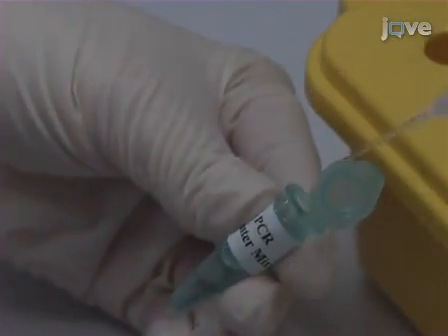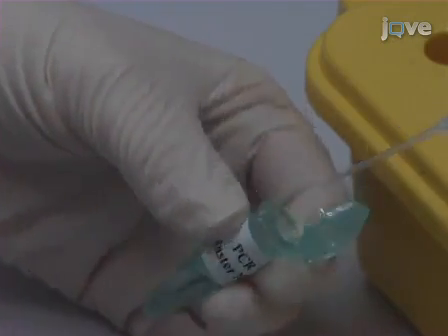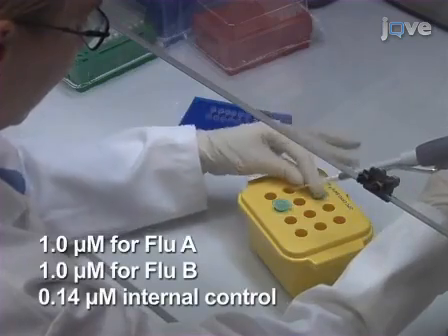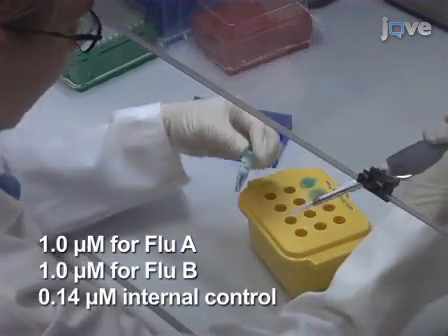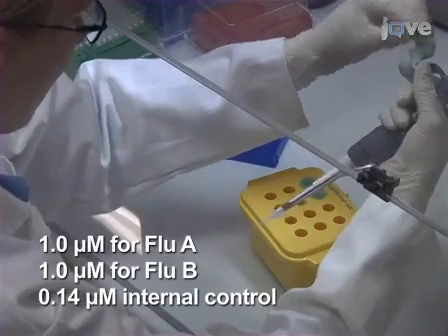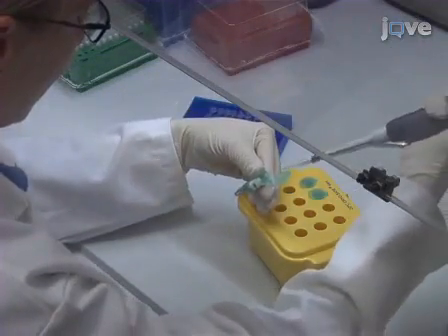Prepare the RT-PCR master mix on ice according to the manufacturer's protocol using a biotinylated dNTP mixture. Add the flu-chip primer mix, which contains the concentrations shown, to the master mix. One primer from each set should contain a 5' phosphoryl group to facilitate enzymatic digestion.